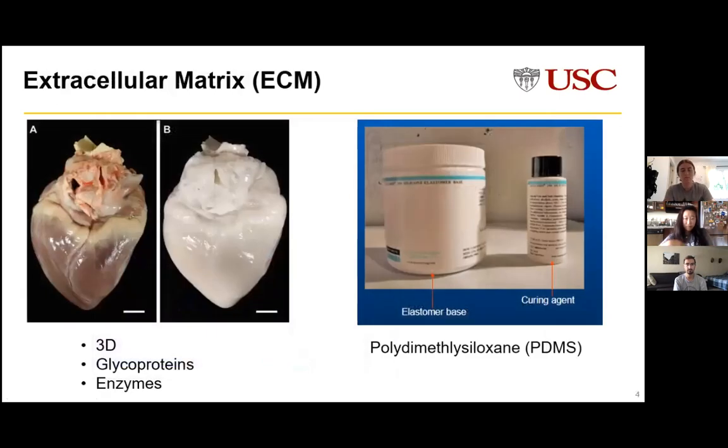So what our lab does is we make organs on chips, and we aim to recreate different organs on cover slips so that we can see their mechanobiology or other features of those cells using a microscope.